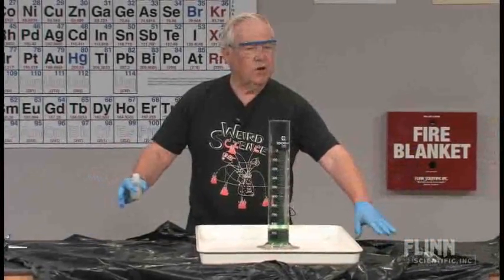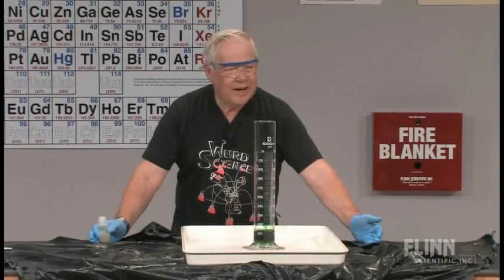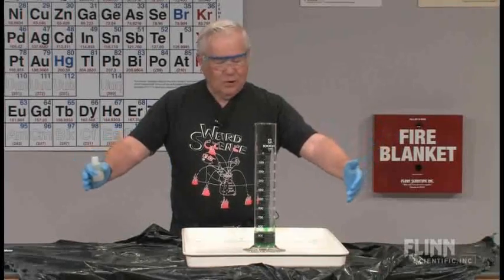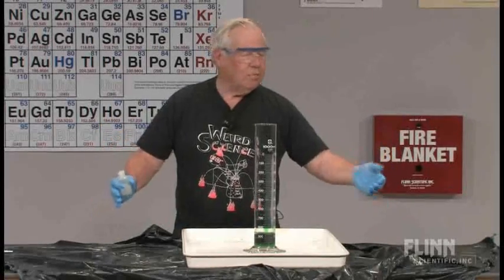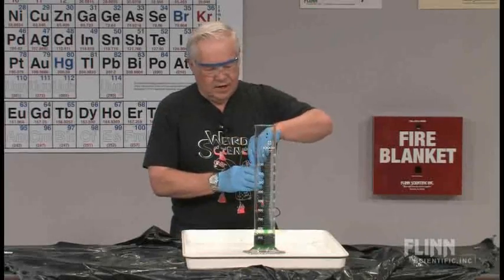I put some additional trash bags under it. If you're in a classroom and you don't have a big tray like this, I suggest you take a big trash bag and put it underneath, because you may need it. It's prudent to do that.